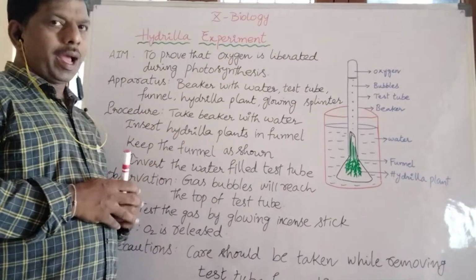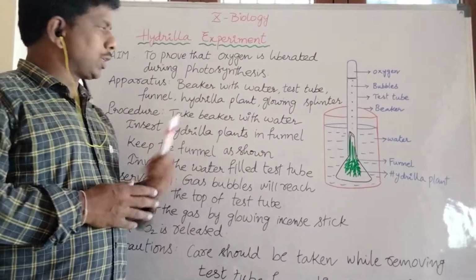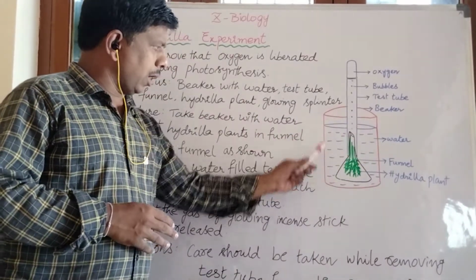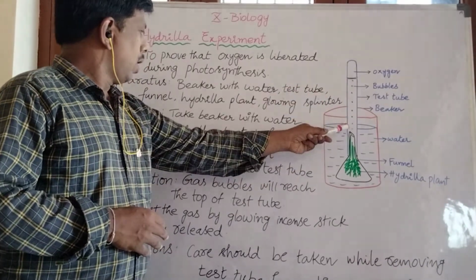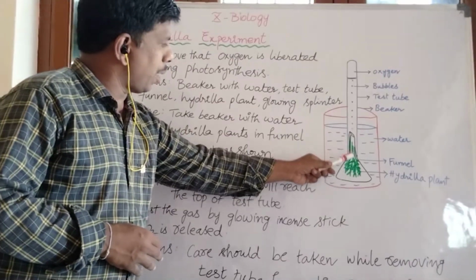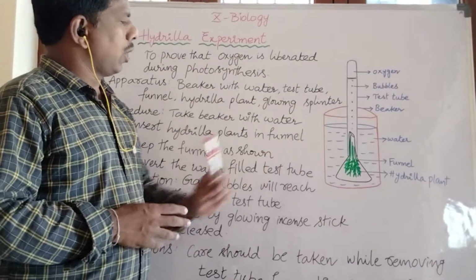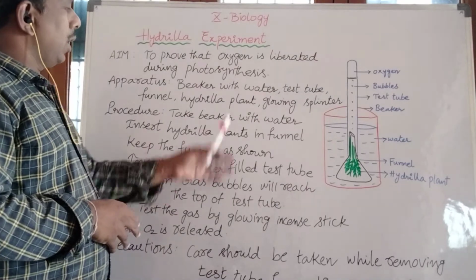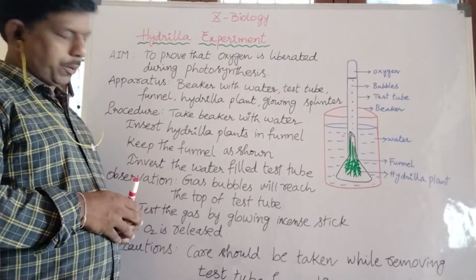And next, apparatus. What apparatus is used to conduct this experiment? One beaker, this is the beaker, along with water, a test tube, a funnel, and also the Hydrilla plants, small Hydrilla plants, and also the glowing splinter. So these are all the essential parts which are used in this experiment.